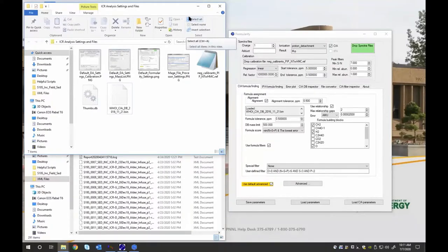Now, second note, there's a lot of difference between water and sediment. That could also be messing with the calibrations as well. Complex mixtures are complex. And when you go to sediment or even soil, things get even more complex than water. But in our case, we are trying to develop a new calibration list that might be able to somehow control for the differences that exist between the sediment and surface water. Might not improve results at all, but at least the calibrations are better. There is a question of targets, but the one that I've provided is a fairly broad range general negative calibration list for samples collected using ESI negative ionization.